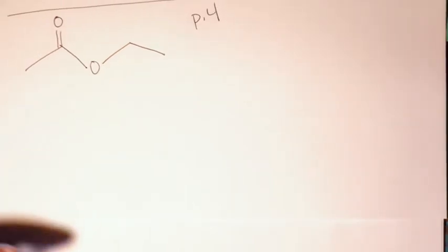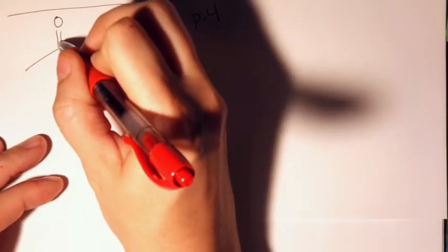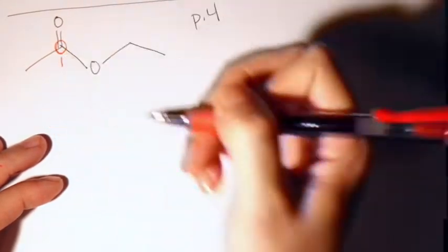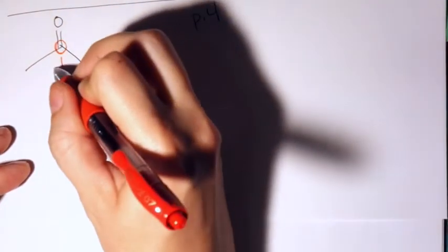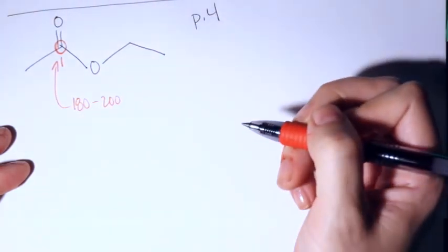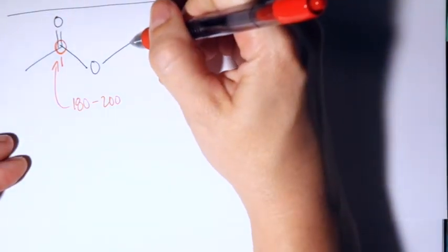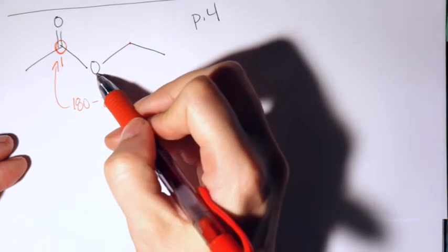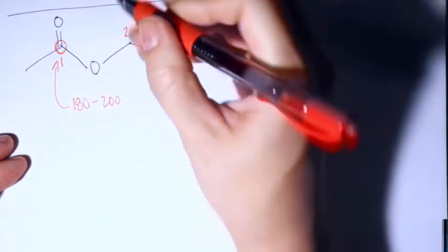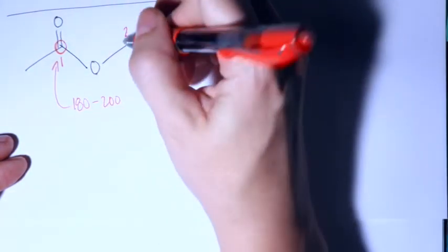All right, so here we have some more electronegative atoms than the last one. Like this carbon right here, again, a carbonyl, that one's going to be the most downfield, in that 180 to 200 ppm region. And this carbon right here is attached directly to an oxygen atom. So this one we would expect to be the next one, going from downfield to upfield.